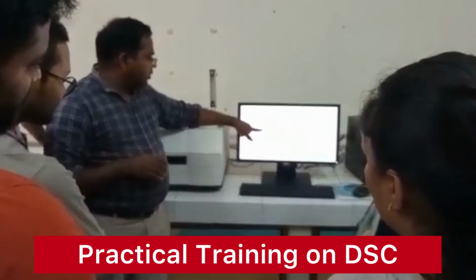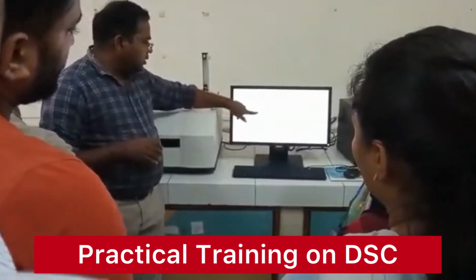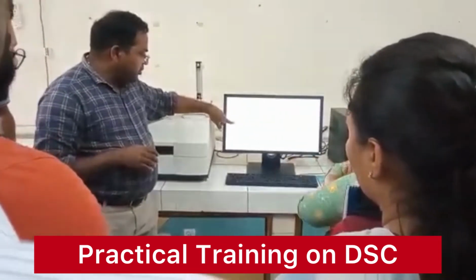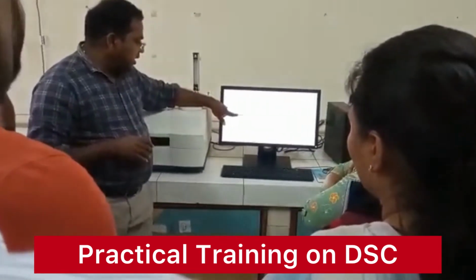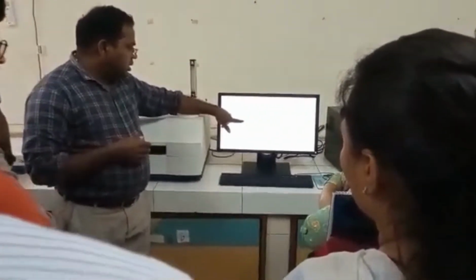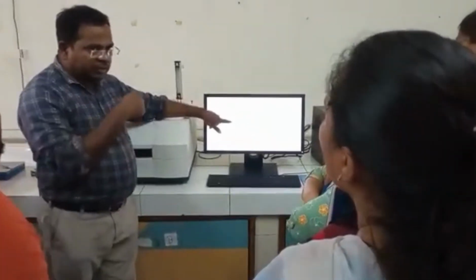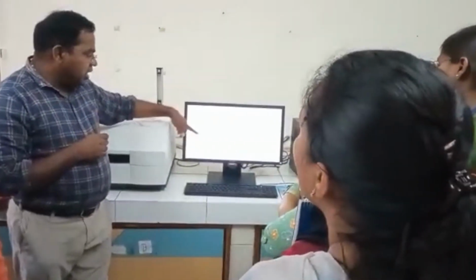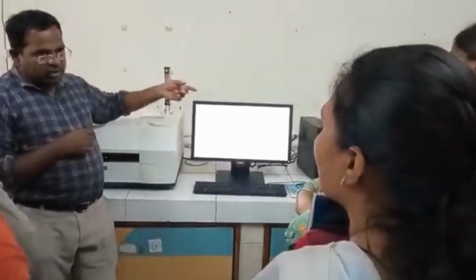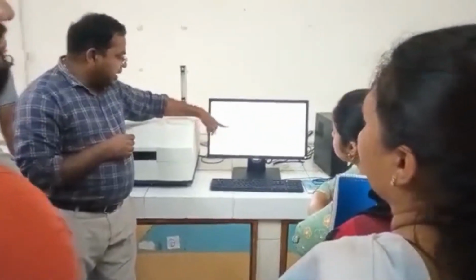0.2 seconds sampling, save button. So the first step will be run with the data also saved. The second step 150 to 10 with the 10 degree, maybe I just kept it 5 minutes hold time. This particular step I have not saved. I have not checked the data. So naturally the second step also will be run by the machine, but the data may not be saved. Okay. And the third step again I take.